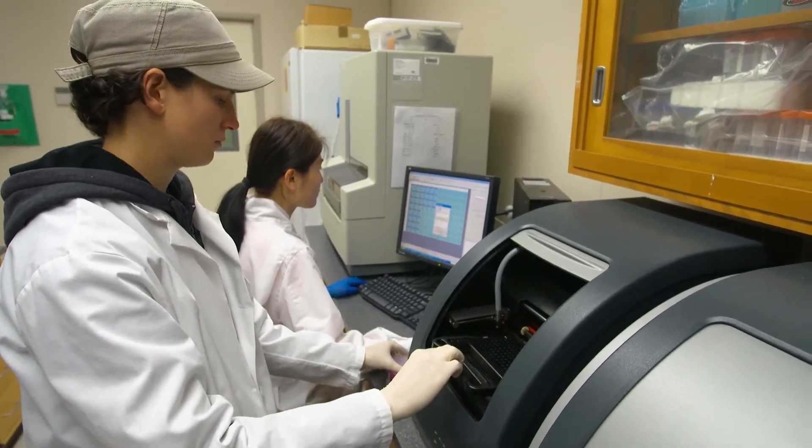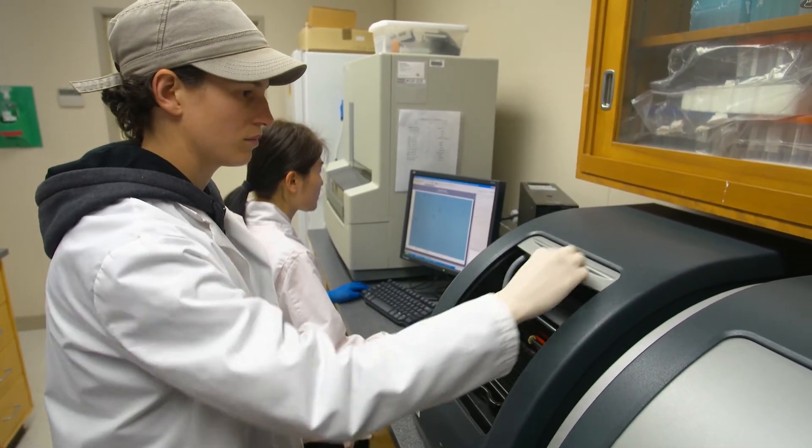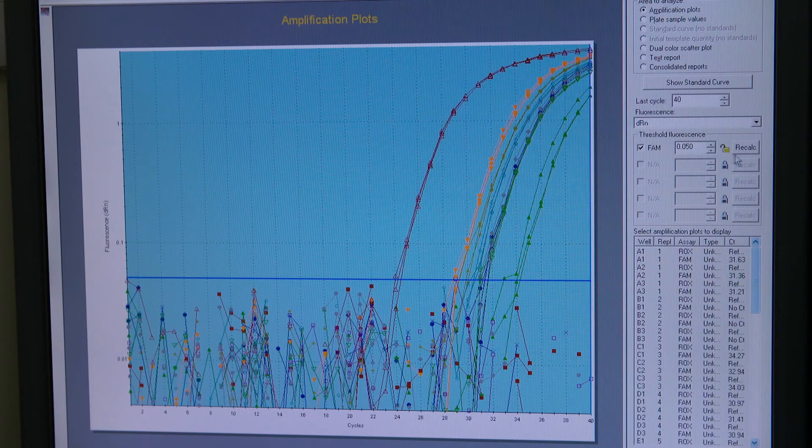Samples from the molecular lab are loaded into the RT qPCR machine that will produce data to indicate if viral RNA is present in our sample.